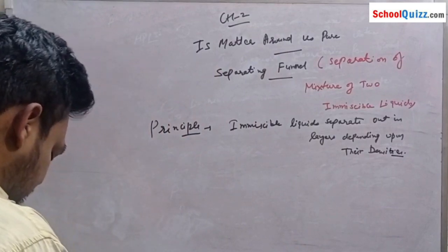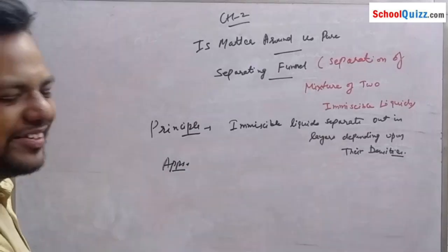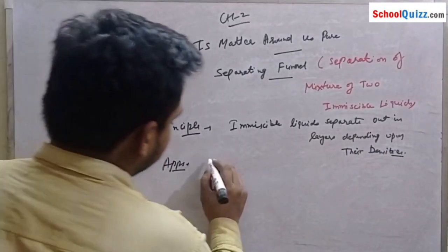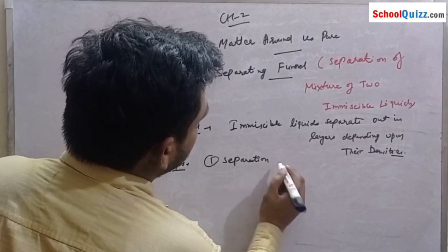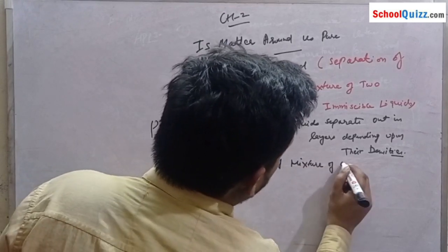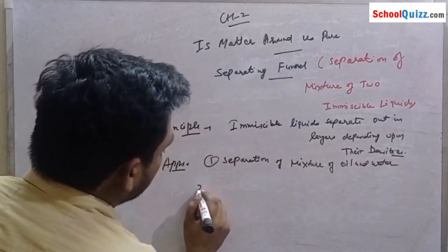Now we can write its applications. Two applications are there, a very simple technique. First, the example we have taken: separation of a mixture of oil and water.